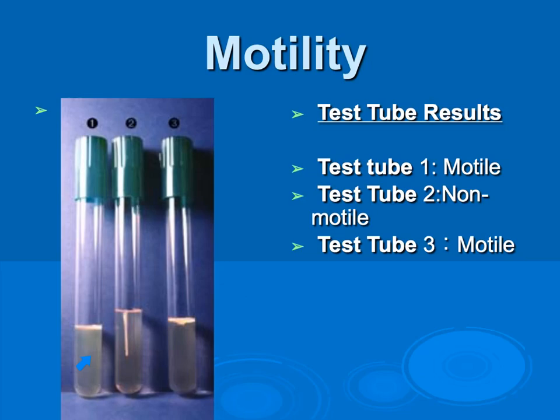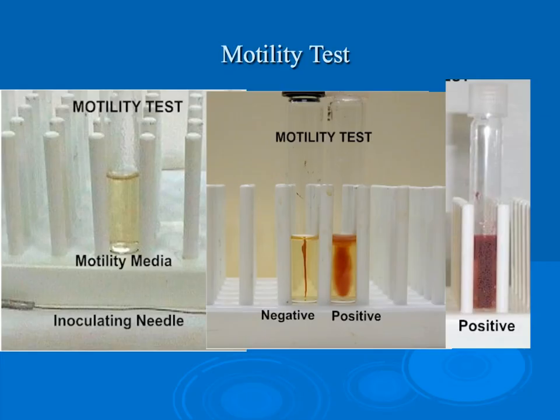So we have positive for motility, negative for motility, and positive for motility. Here we have just a couple more motility tests to look at. You can see a negative — just where the needle has stabbed the agar — and here we can see how the bacteria has grown out from the stab.